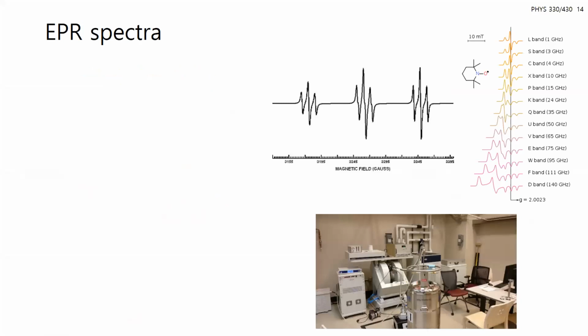And then finally, I do want to mention a little bit about what EPR data is and how the instruments work. You can see that this is what a typical spectrum would look like for EPR, or specifically here, a commonly used radical label that's measured in EPR. The signal looks quite different from what we have been showing for NMR.